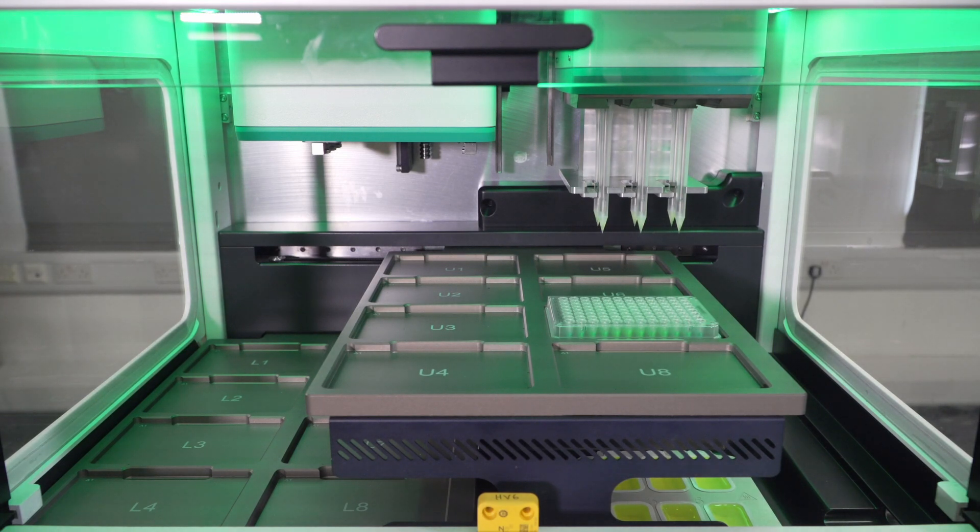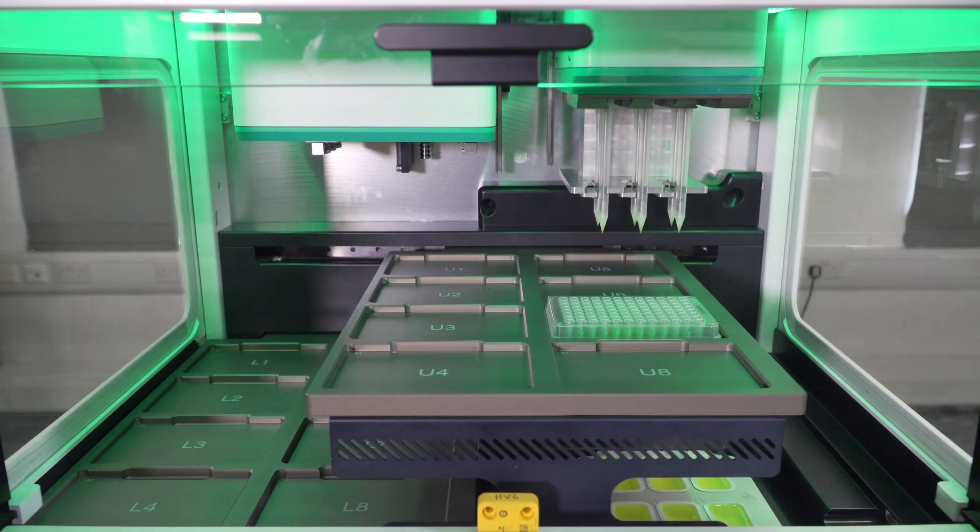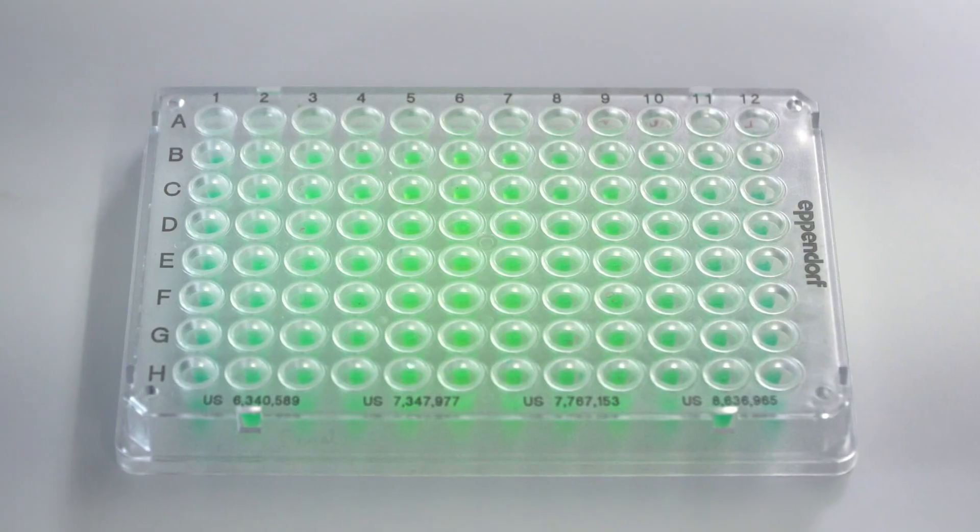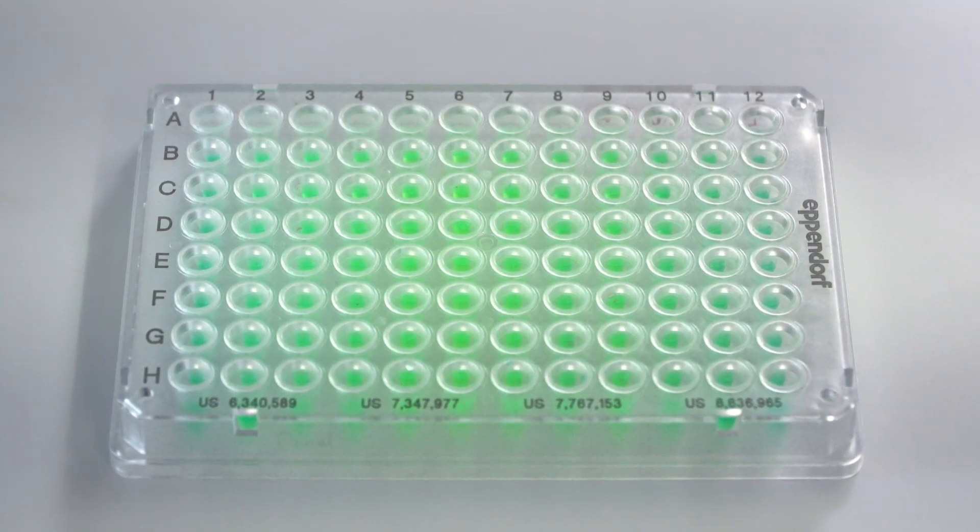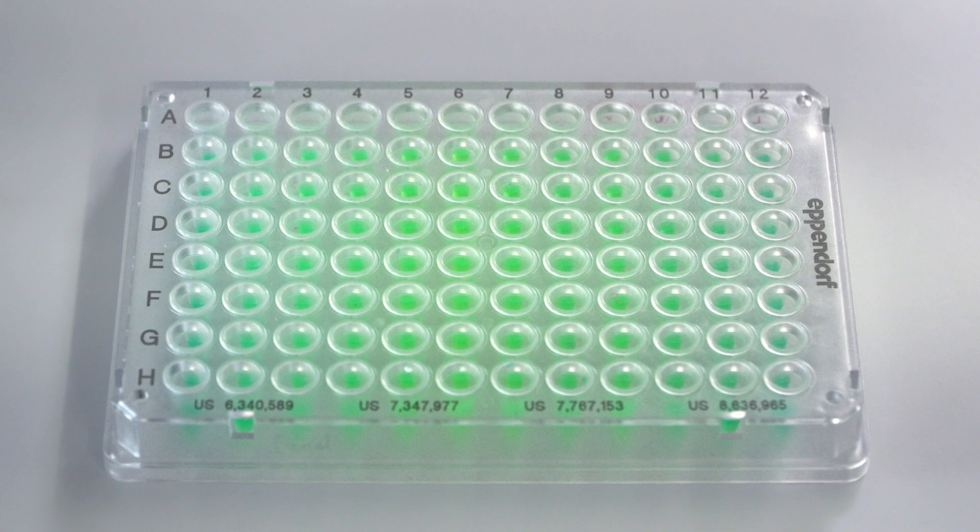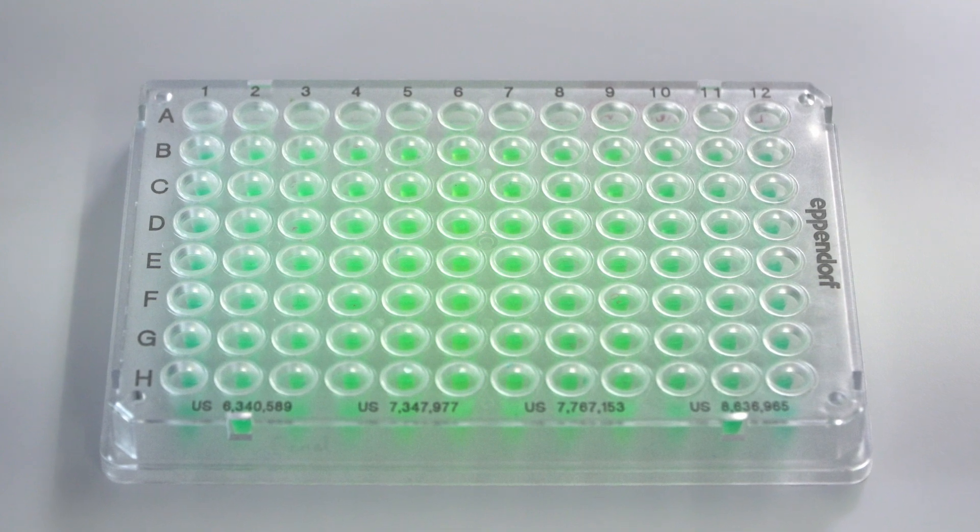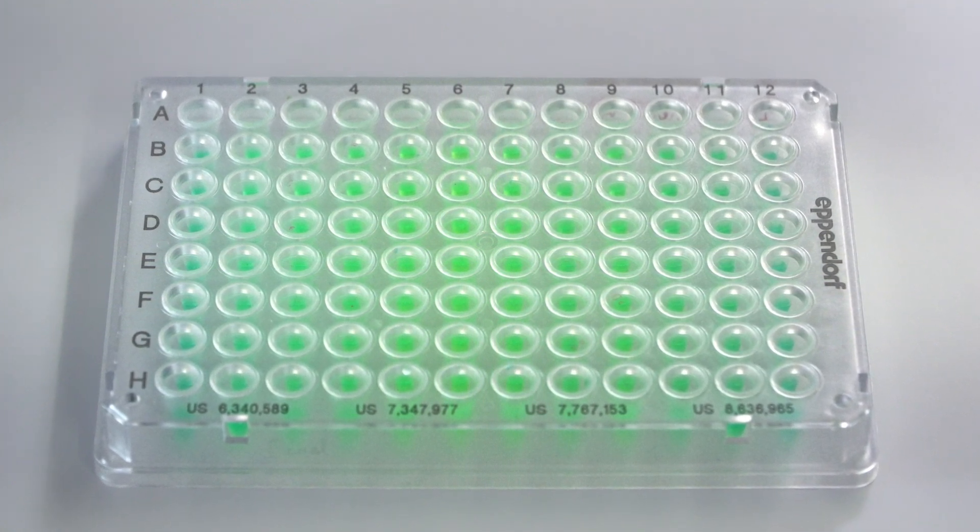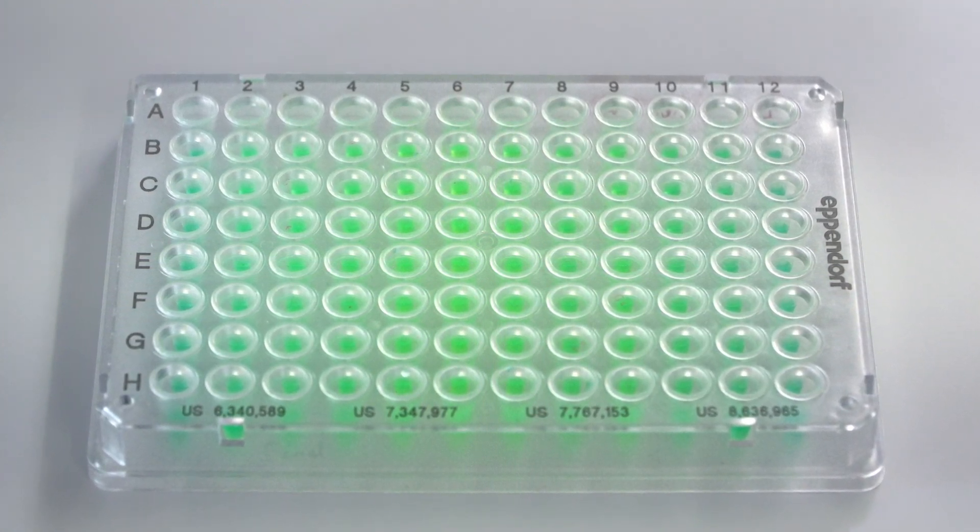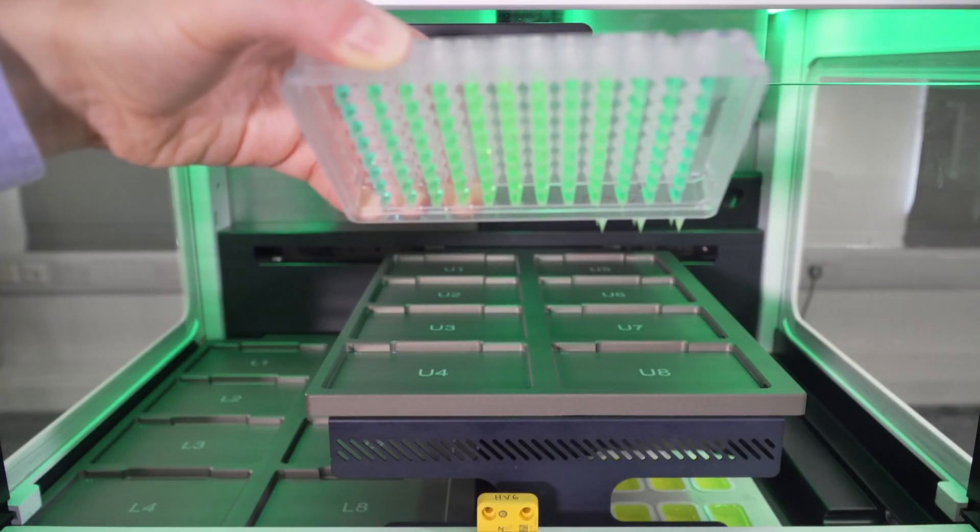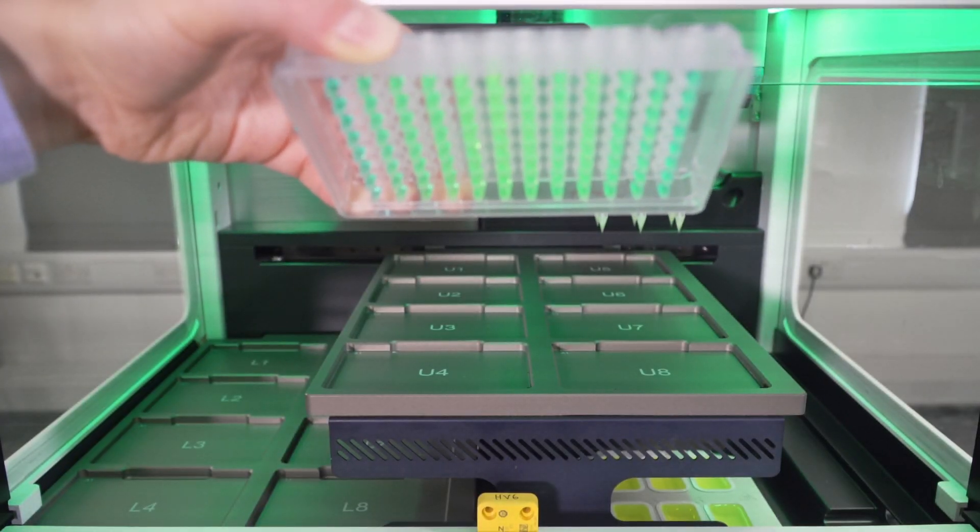So now I can see that the protocol is complete. And if we have a look at the plate, we started with blue, and now we have a gradient of colors that was created by the yellow diluent that was added by the dispense head. And that is the end of our protocol.